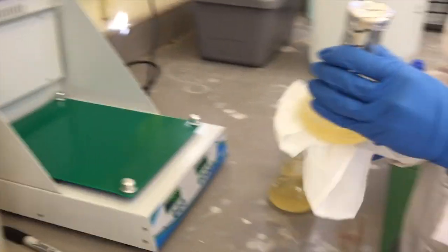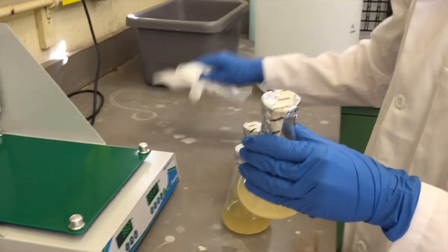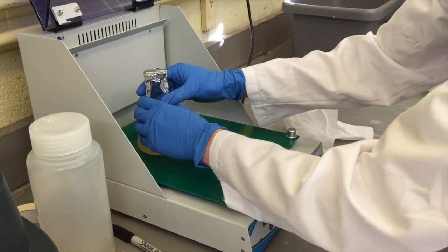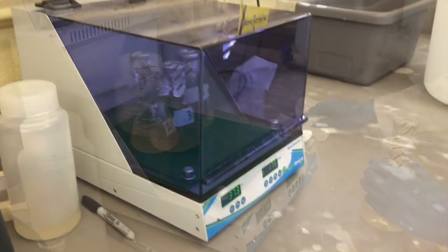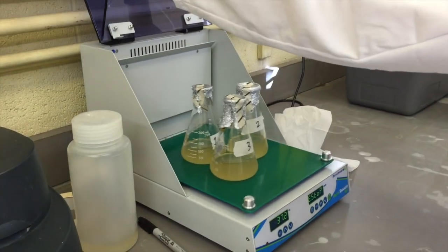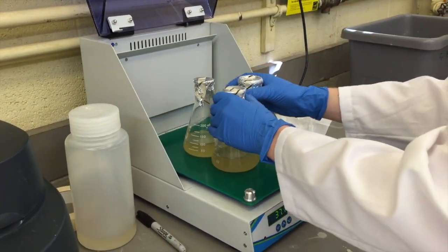Wipe down the bottom of the flask and press firmly onto the shaker surface to ensure the flask stays in place. In order to determine biomass concentration of the sample, the optical density at 600 nanometers is measured.